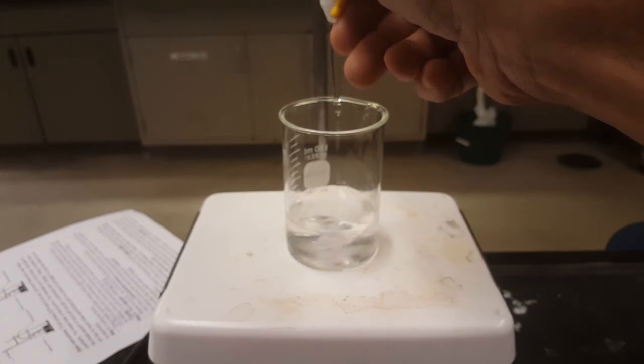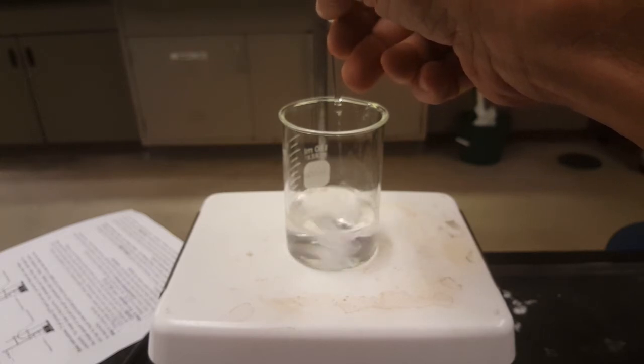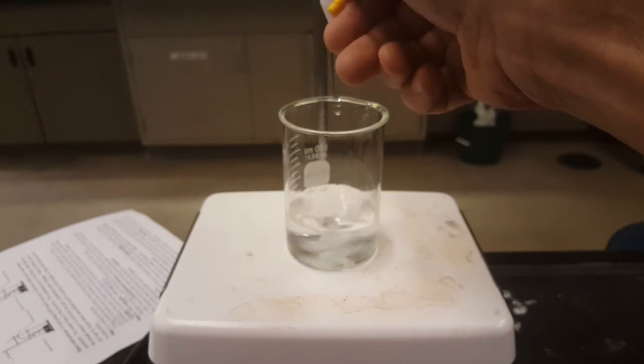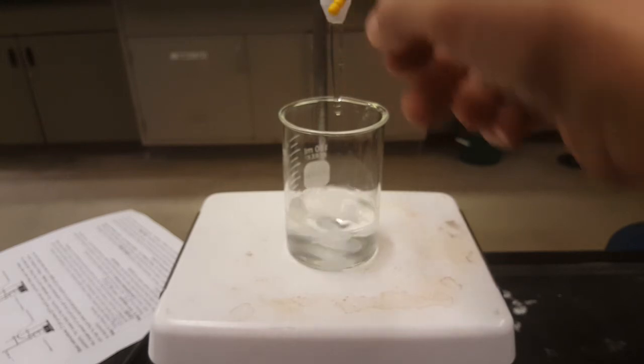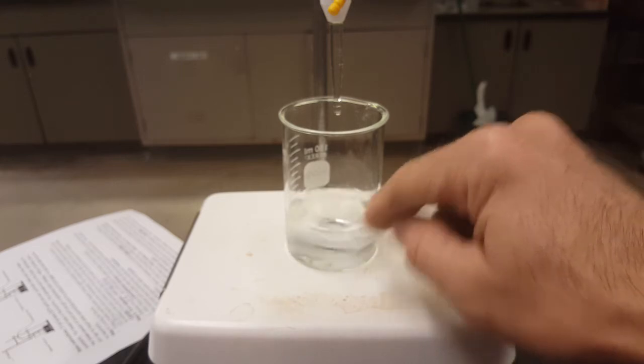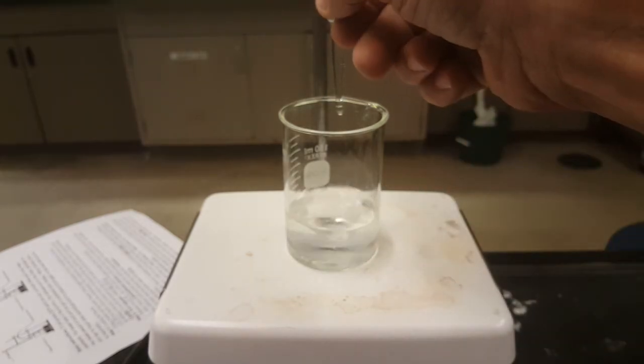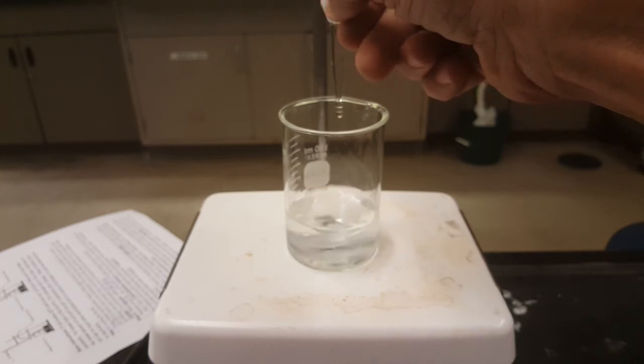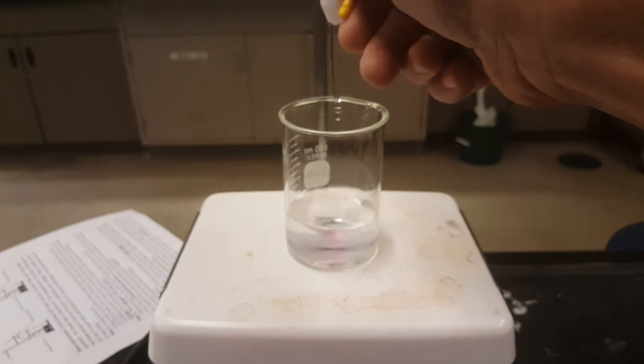I am starting to see some pink, and so I'm going to do a slowdown and stop occasionally, and as long as the color goes back to clear, as long as the pink goes away completely, you're doing a good job.